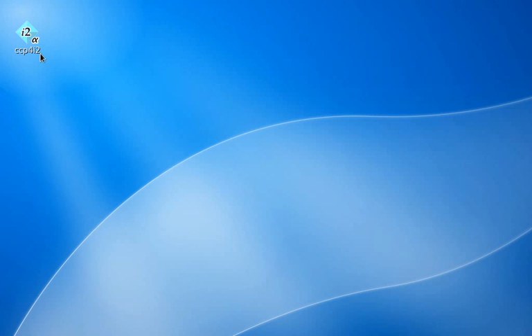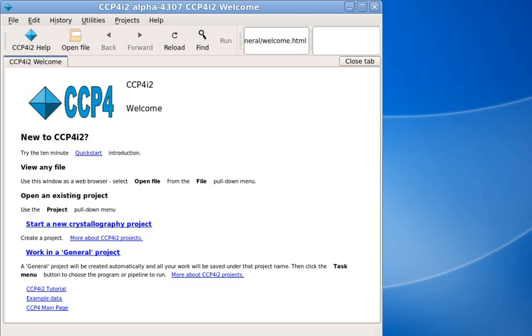This video will help you get started with CCP4i2, the new user interface to CCP4. When you first start CCP4i2, you'll see the browser window.